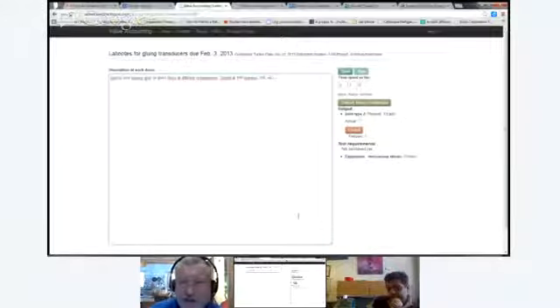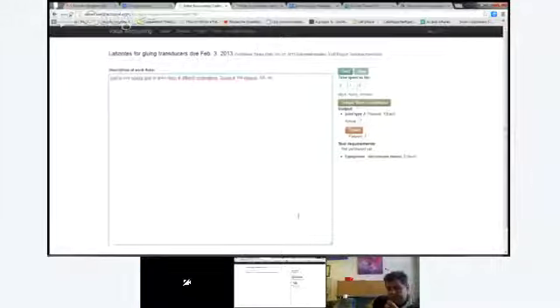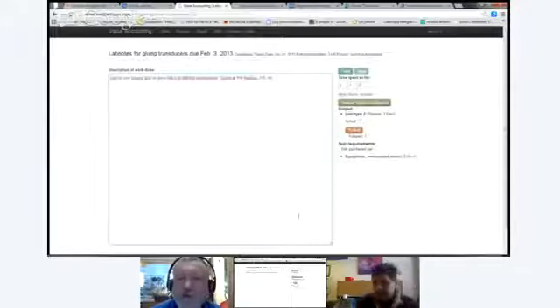It will just be in this other database that will work well for a bunch of different people using it at the same time. Right now, you might run into some problems on that score. It would be more in slowness. You won't actually lose data.